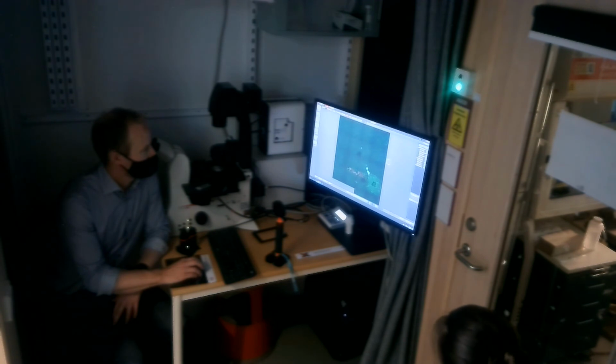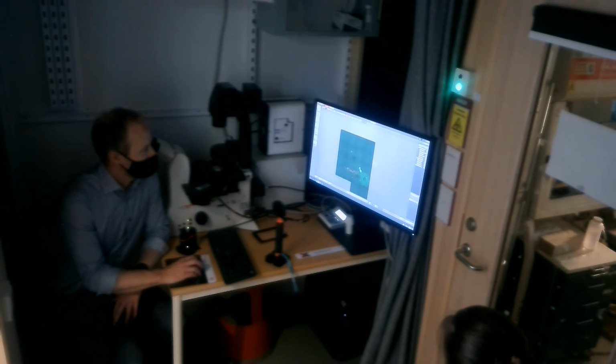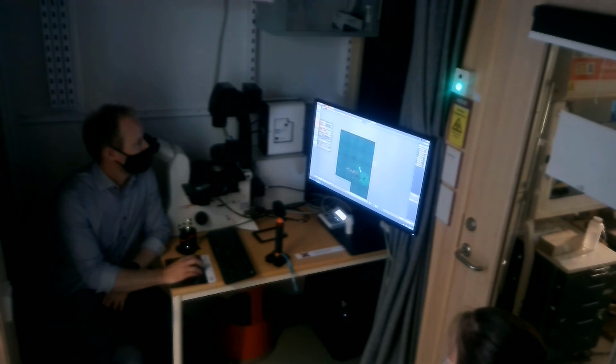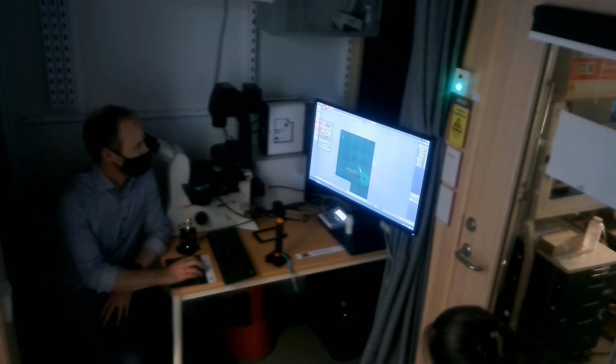Alright. So we're almost there. What else? Oh yeah. Let me remove the autofocus. I will not work with autofocus at the moment, so I will take that away.